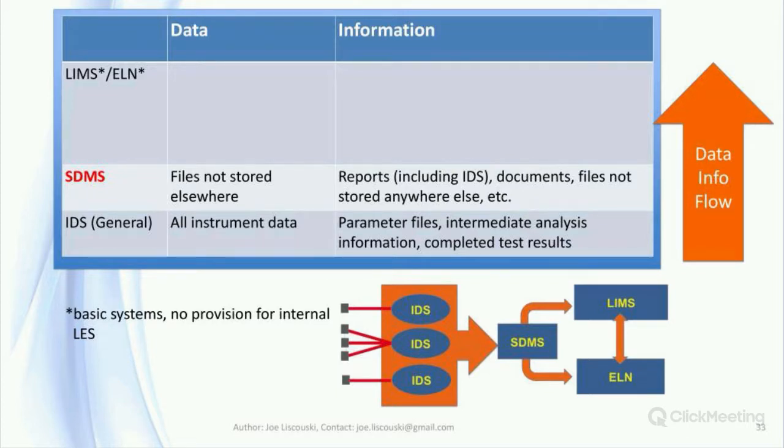Reports from the instrument data systems would be held here. The reports would be parsed for information that needed to be sent to the centralized systems. Any documents not held within the LIMS or ELN would be stored here as well.